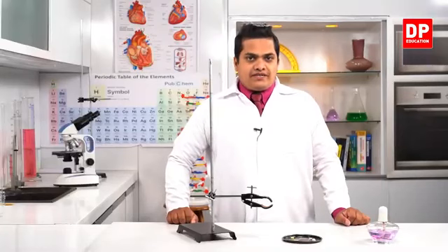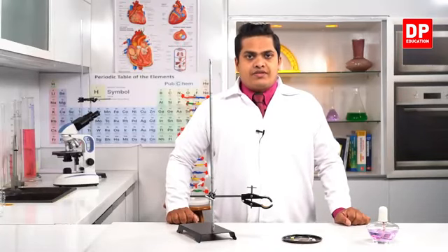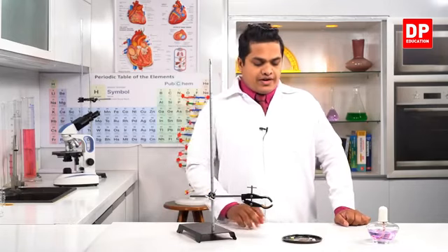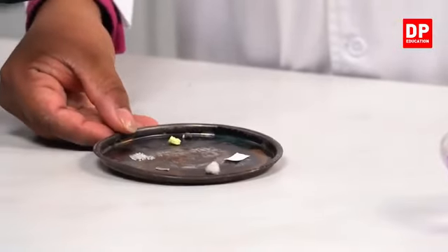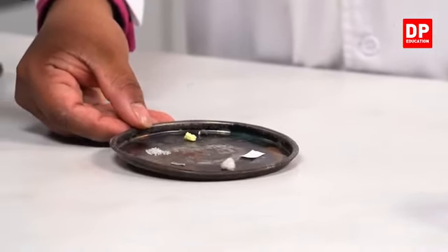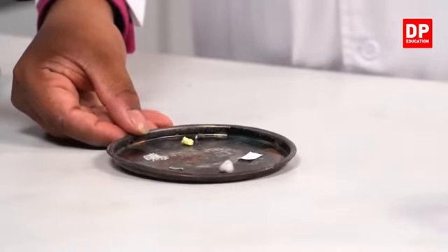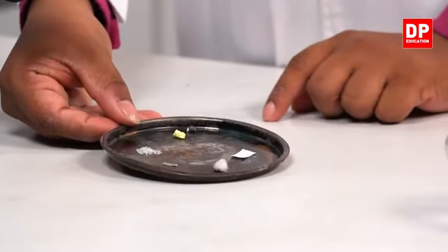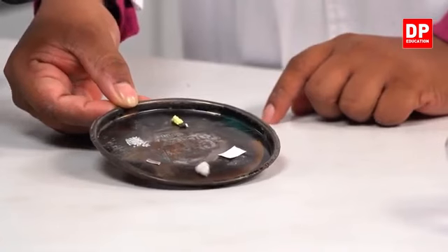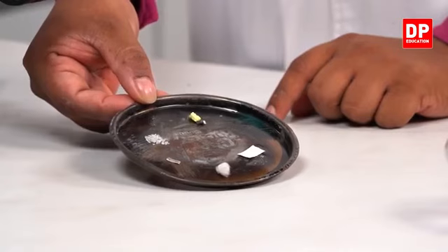Right, my dear children, now in this activity we'll be observing the ignition temperature of several substances. Now I have a metallic plate with me. I'm going to heat it, so I need a metallic plate. Within the metallic plate you can observe there are several substances. So what are the substances?